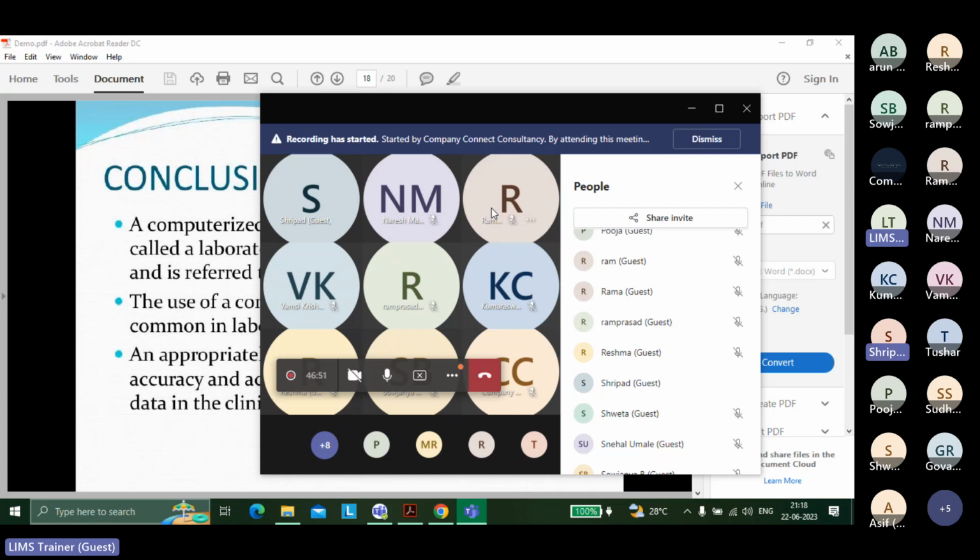Because today everyone I taught LIMS from scratch. What LIMS is. I did not directly start with how to log into LIMS. Similarly, when I go to queries, I'll teach from the basics. What is a query? You got it. Okay. So can we do the job in LIMS as a pharma background person? You see, LIMS is a very, very big ocean. But that will help you.